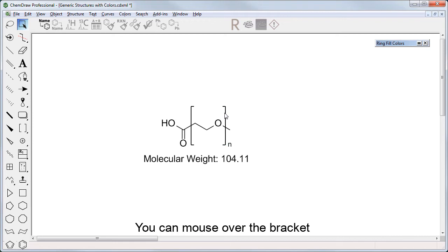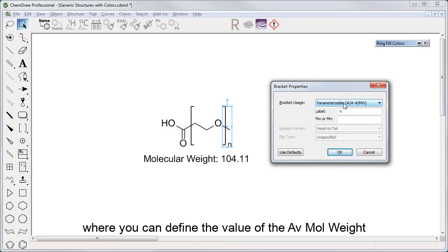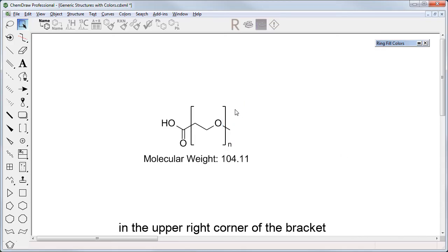You can mouse over the bracket and press slash, which will bring up properties windows where you can define the value of the average molecular weight for the part of the structure between the brackets. You can also right-click over the text field in the upper right corner of the brackets and modify its value there.